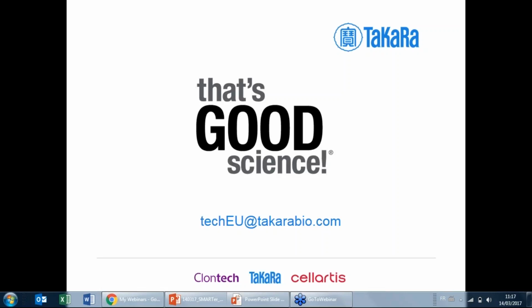Another question. Is it possible to use SMART-Seq v4, the single-cell kit, with frozen cells? So yes, the kit is compatible with frozen cells. We provide some specific recommendations on how to do that.